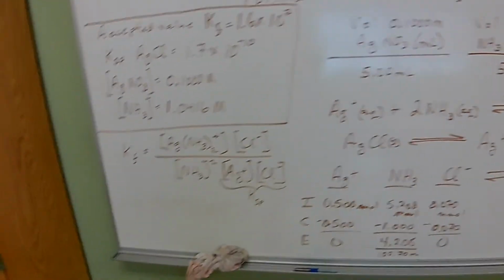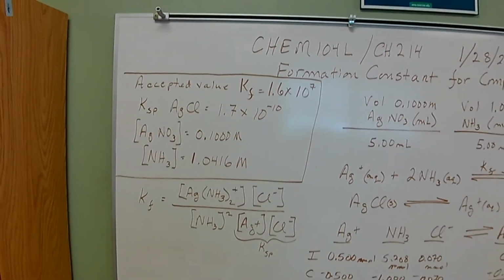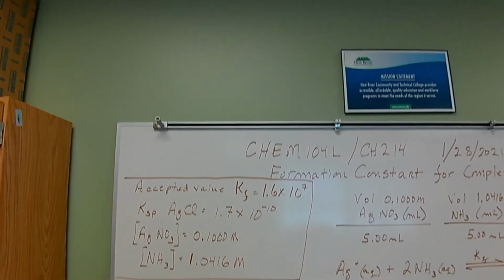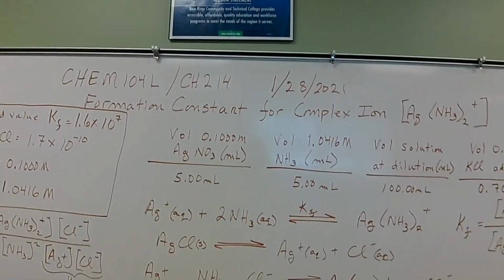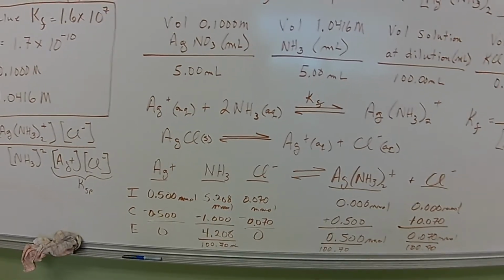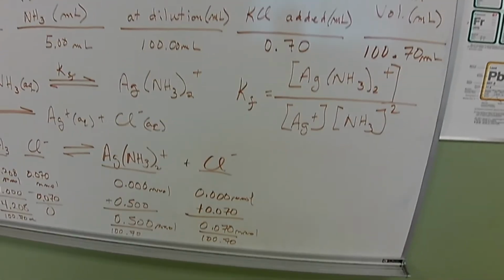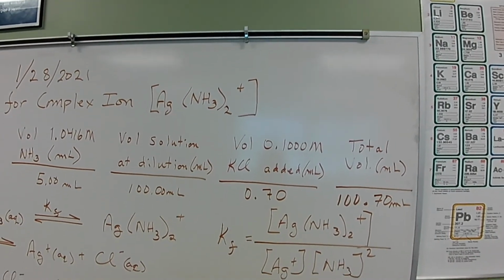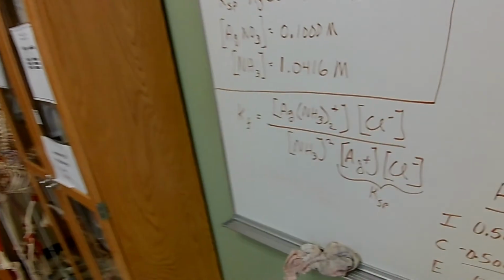Okay, so let me take a slow look. I'll tilt my head back to be sure that everything is in scene for this part. Then I'll move over. Everything is in scene there, except for the part that I erased. I apologize for that. And then this side. So we got everything we need to finish the report. All right.